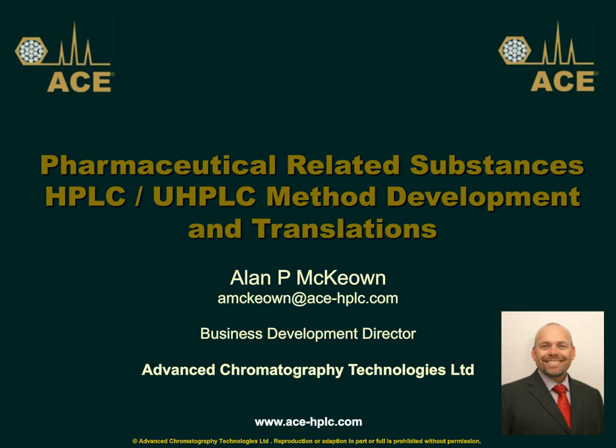Excellent. Thanks, Alan. What software was used to optimize temperature and gradient conditions in the method development for paracetamol? So there are various softwares available. In the example that I showed, I think the screenshots were taken from DryLab or LC Simulator. I can't remember which one it was. Both method optimization modeling packages gave similar results, but I think it was either LC Simulator or DryLab. I can't remember now. Okay, thank you.